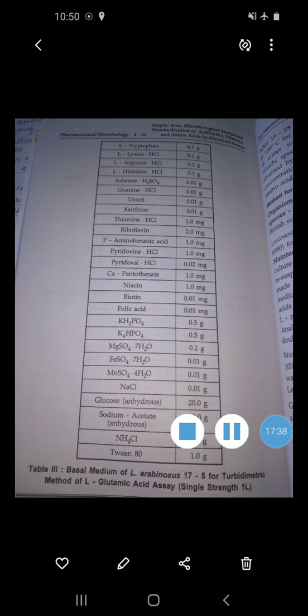Then water is added to each test tube to make a total volume of 2 ml: 2, 1.8, 1.6, 1.4, 1.2, 0.8, 0.4 and 0 ml. 2 ml of double strength assay medium is added to every tube, and micrograms per tube of amino acid are added. For valine and leucine, it is 0, 2, 4, 6, 8, 12, 16 and 20. Then for methionine 0, 0.5, 1, 1.5, 2, 3, 4, 5. All tubes are set up in triplicate.